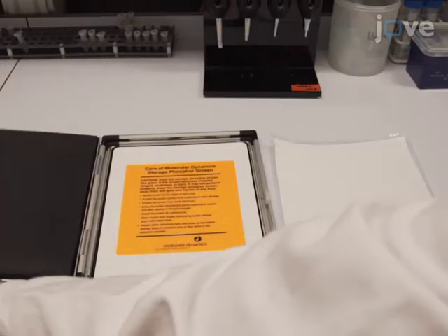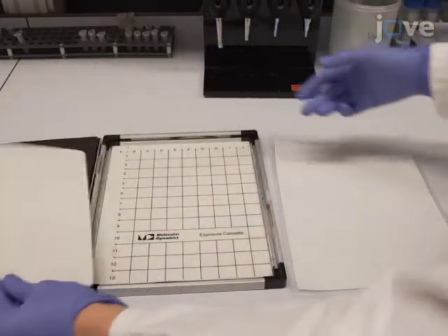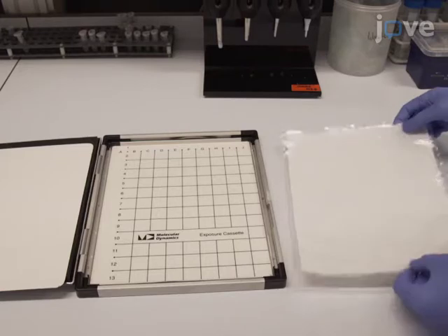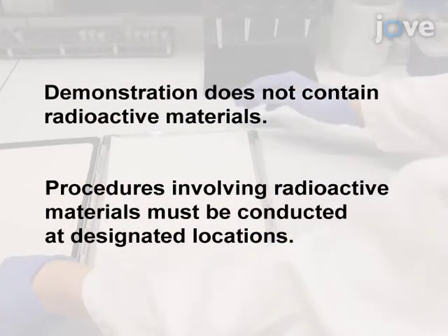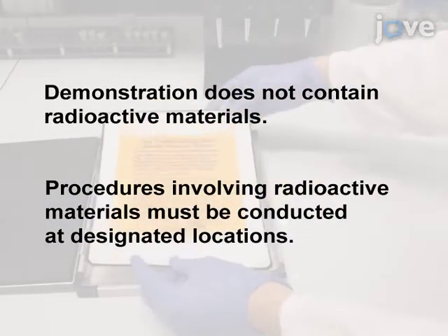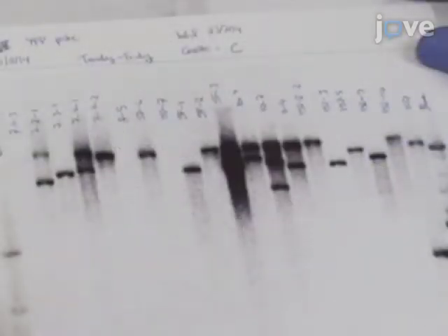After performing DNA blotting as detailed in the text protocol, perform blot analysis. The analysis depends on the restriction strategy used. When analyzing the blot using the strategy with one restriction site in the middle of the tDNA, count the number of the fragments detected. In this strategy, the number of hybridized fragments suggests the number of tDNA integrations.